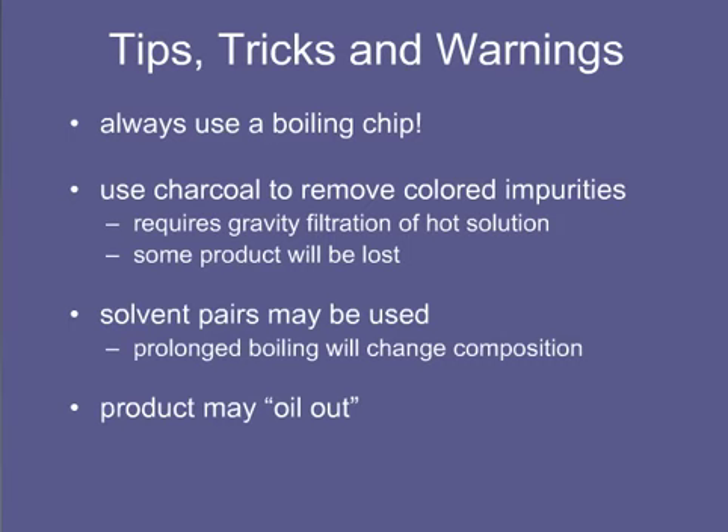If a product oils out, you can try adding more solvent and continuing to heat to redissolve the oil. If the oil persists, you can cool it until it solidifies and recrystallize the resulting solid. You may want to choose a different solvent for your next attempt.